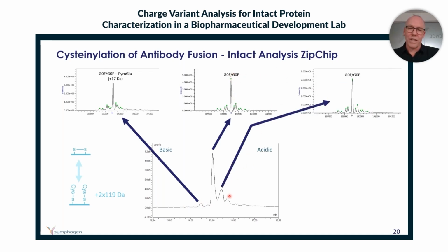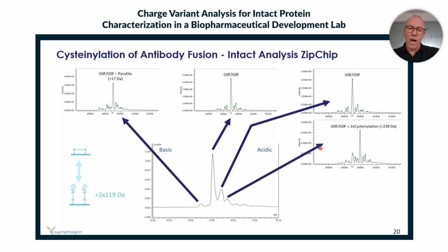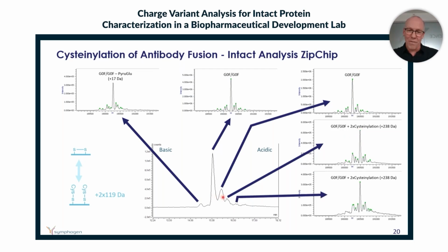We also see some acidic peak that's classical for deamidation. It's nearly the same mass more or less. But when we go out to these more acidic peaks, we actually start to pick up our cysteinated forms. So you have a deamidated form of the main peak. You will have the same effect for the cysteinated form, where you have a minor form because they are independent modifications.